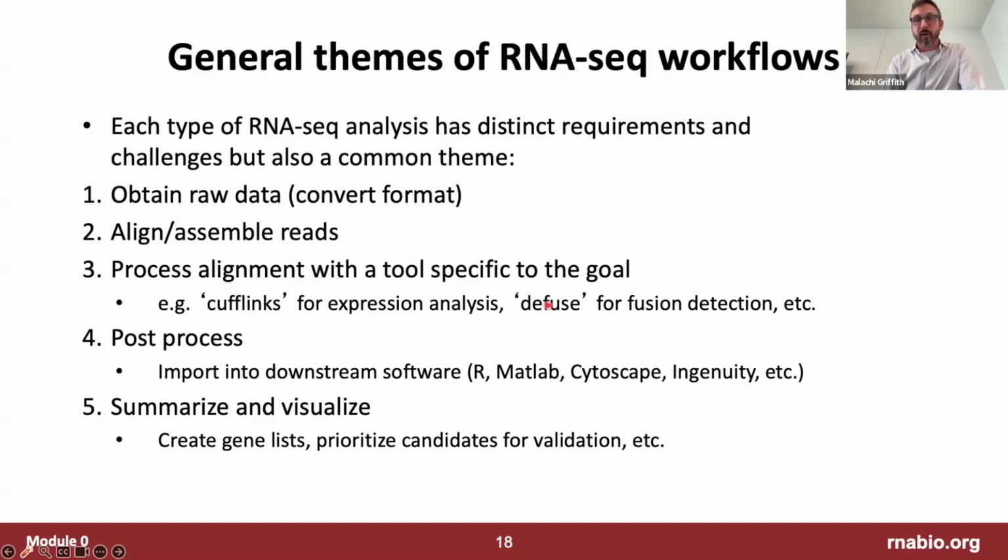And so there's a whole bunch of tools from many labs that ask interesting questions of RNA-seq data, starting with a BAM file as input. That's the alignment file. And all of those tools, that's where things get kind of wild, the output of all of those tools is quite bespoke. So then usually there's some kind of downstream step, because every one of these tools outputs the information in a different way that's suited to that question or interpretation of that kind of analysis.